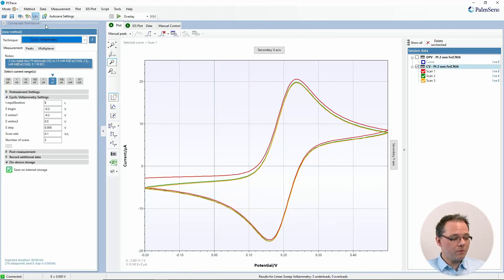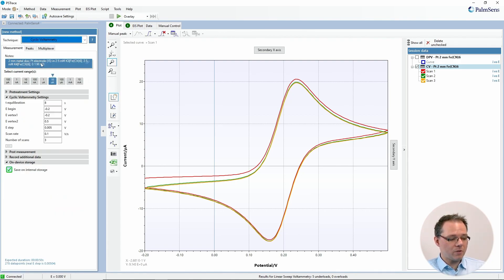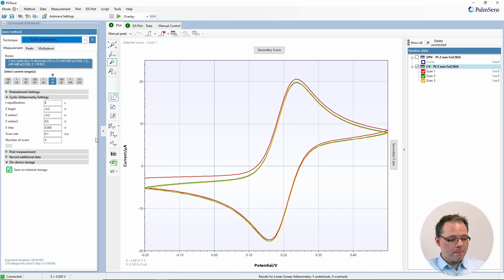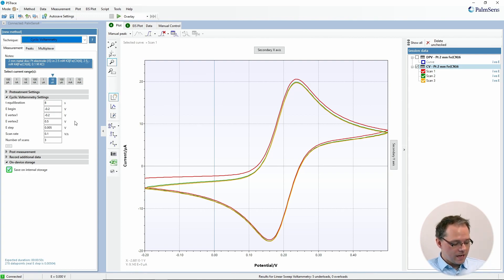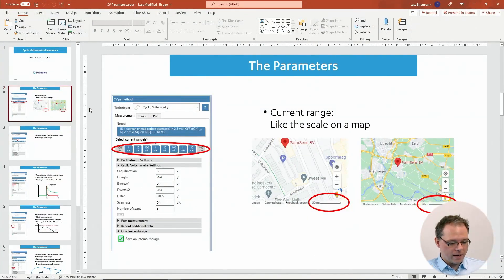If you want to perform cyclic voltammetry, just connect your potentiostat, select cyclic voltammetry, and you get the mask to set all the parameters. To more easily explain all the different parameters, I have prepared some slides that we're going to have a look at right now.